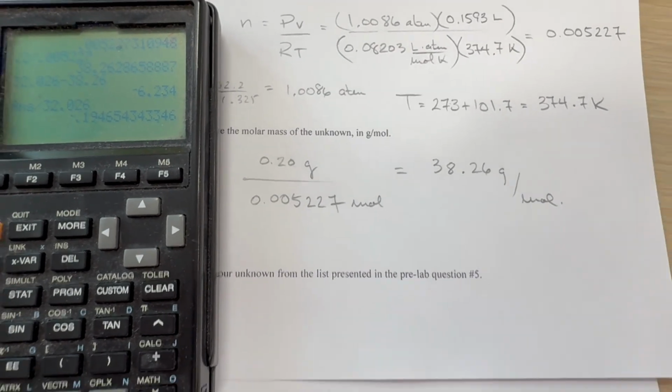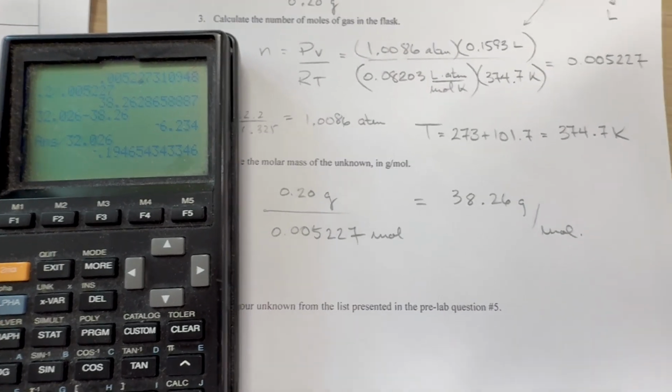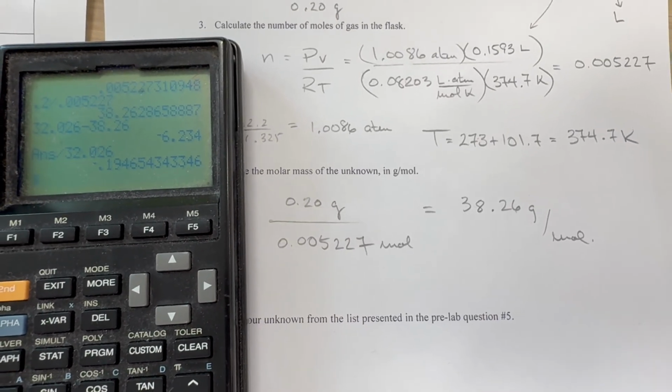Probably not our greatest experiment, but at least it gives us an idea.